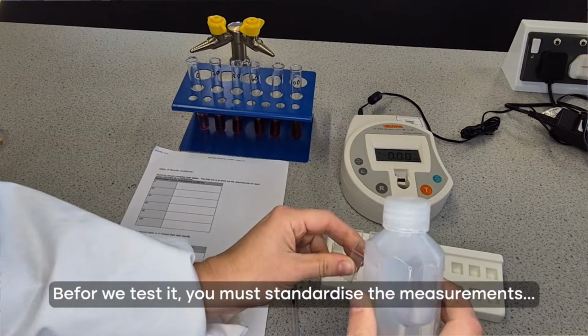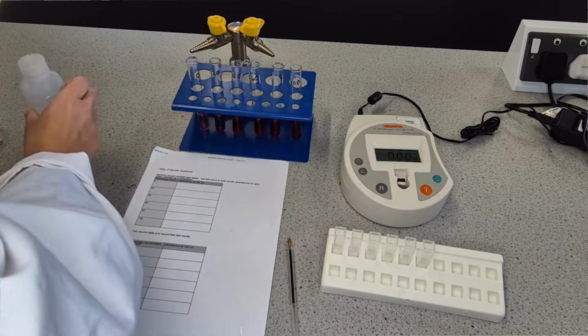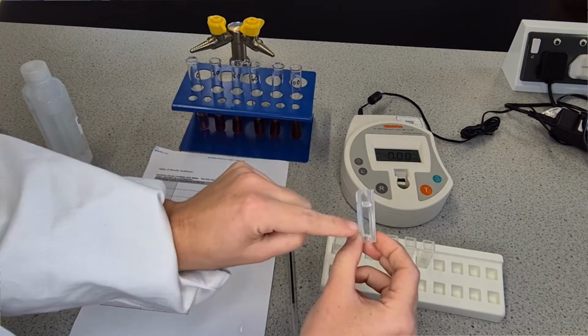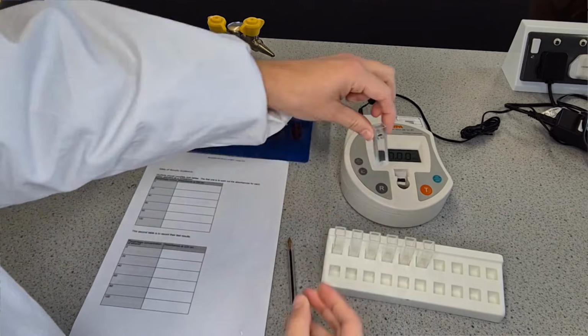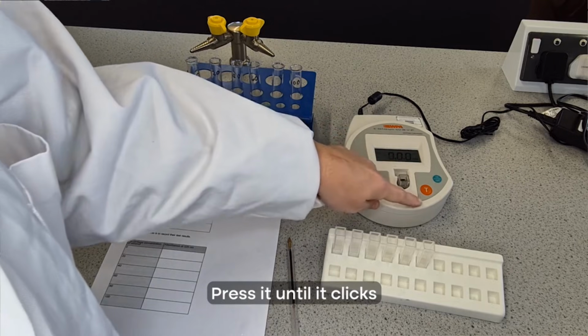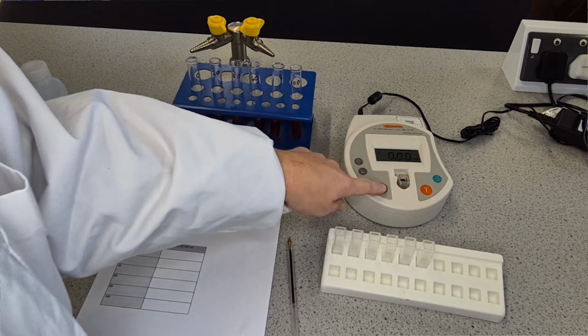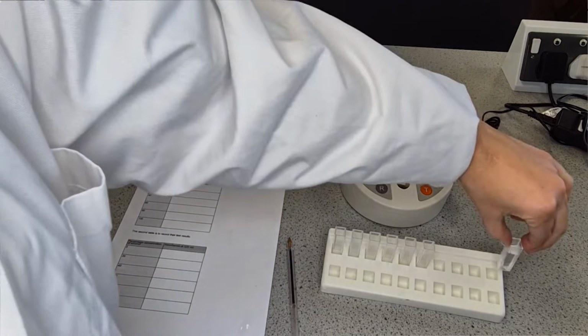Now, before we test it, we do have to standardize our measurements so that we know that every time we're saying 0 is whatever the absorbance is with distilled water. So I've got 1 cuvette that I've filled up with just distilled water. Place it in until you feel it click. And then I'm going to press R, which is our reset, which basically means we're standardizing to say that is 0, and that's what we're going to compare to.